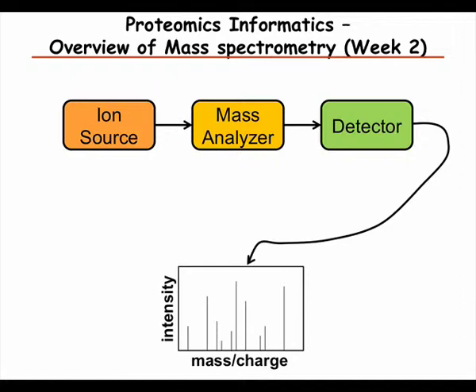That's not at all unusual. Then you have two different peaks that overlap, and you think you're quantifying one thing, but it's really two.